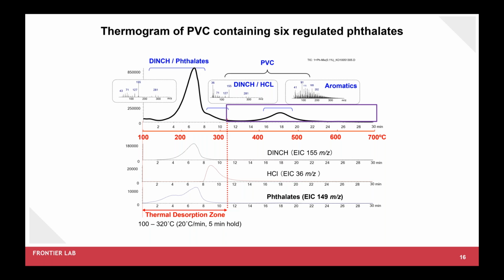And this means that the polymer remains in the sample cup and is not introduced into the GC inlet column, or MS. And because the bulk of the sample, which in this case is the polymer fraction, remains in the cup, more sample amount can also be placed in the sample cup to improve the signal to noise of the target compounds.